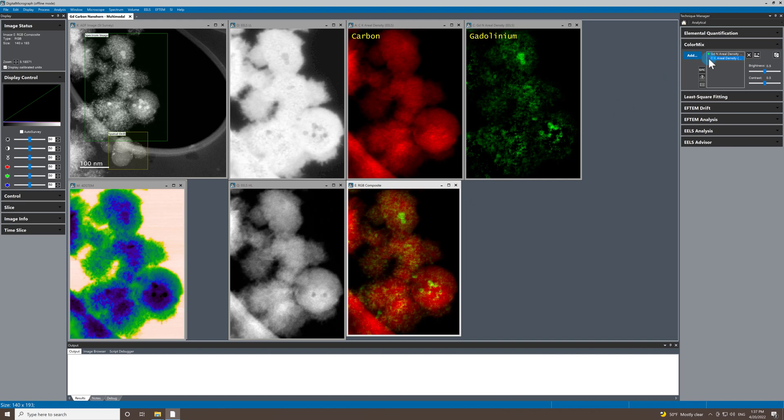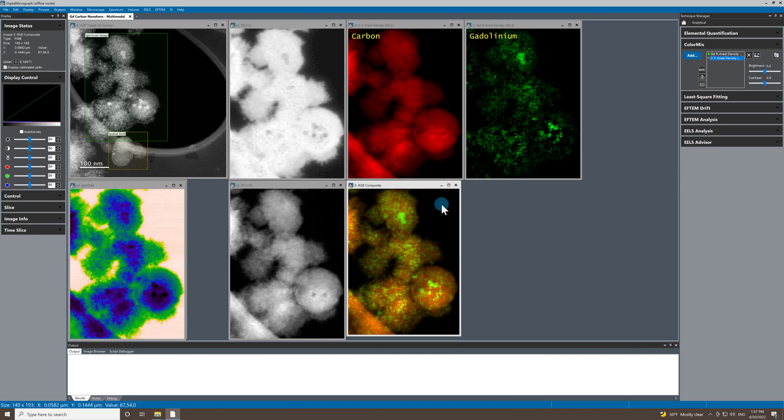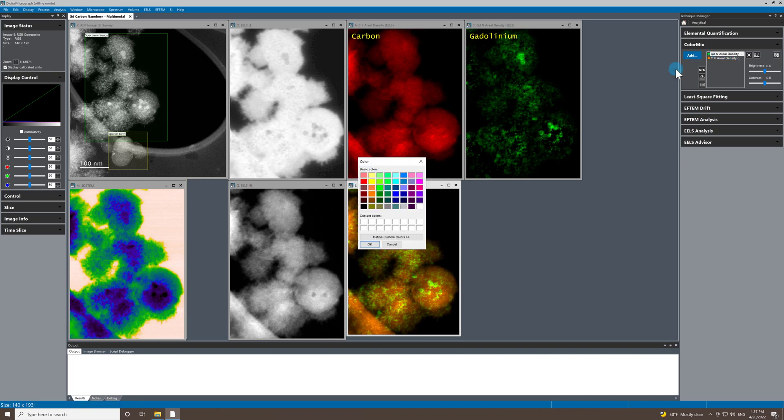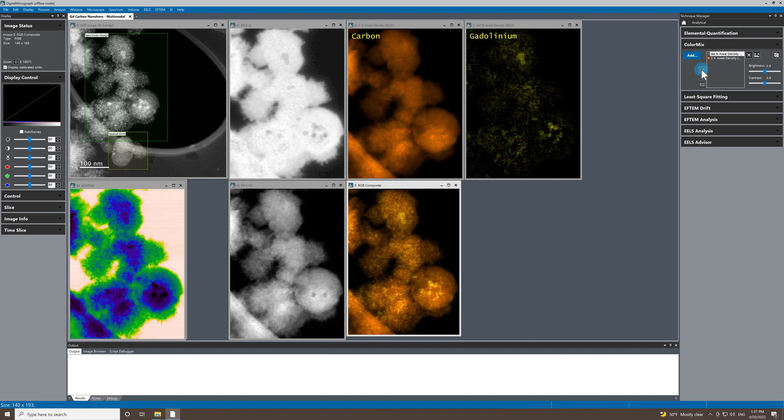So let's go to the carbon, change the carbon to orange, go to the gadolinium, change the gadolinium to this kind of gold color, and then just recolorize the source images.